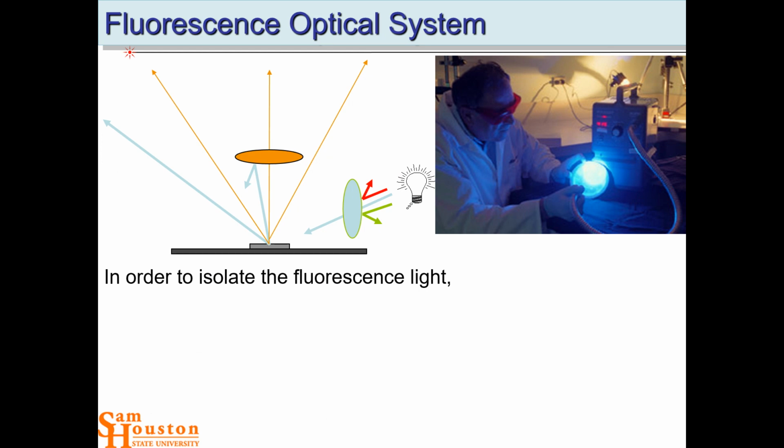We were shining the light on the desktop, which had a filter that allowed only the light we wanted to illuminate with. And in this case, it was UV. Here in this screen, it's blue. So this filter is letting blue light from the source hit the sample, and then the blue light is scattered. So there's a lot of blue light coming off, and then the camera sees everything orange, yellow, and red. It sees all the long wavelength stuff. That's the fluorescent light. And it doesn't see the source.